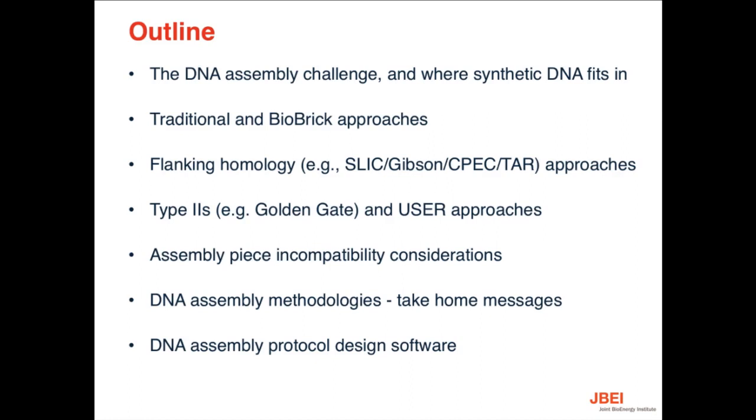As background and context, I'll spend a couple of slides on traditional and BioBrick approaches to DNA construction, then get into flanking homology methods, including Gibson assembly. For additional context, I'll also talk a little about some of the type 2S methods and the USER approach. After these methodology introductions, I'll talk about considerations around the pieces you would be assembling together, what to look out for if they're incompatible with each other, and maybe how to resolve some of those incompatibilities. Then I'll conclude on the methodologies with some takeaway messages.